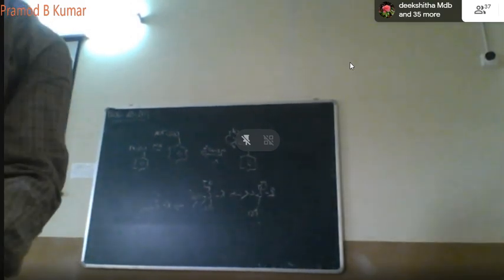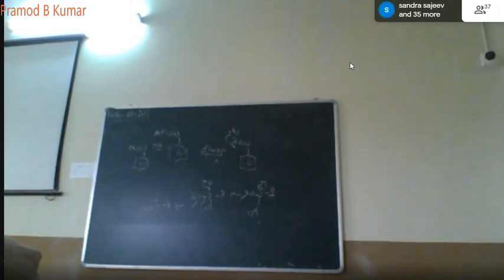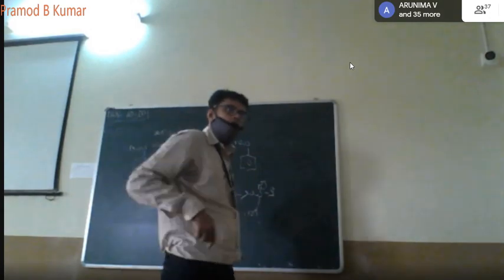You take aniline and do its diazotization reaction.